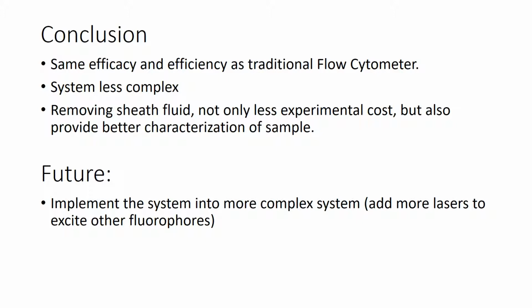So to draw a conclusion, this virtual core flow cytometry provides the same efficacy and efficiency as the traditional flow cytometry. Also, the system is less complex. It is easy to implement and reproduce the system.